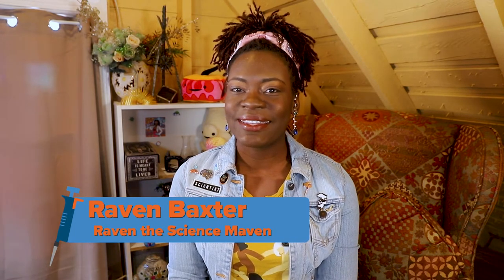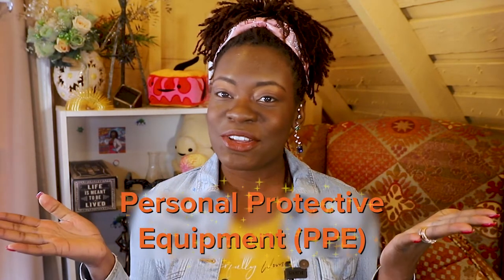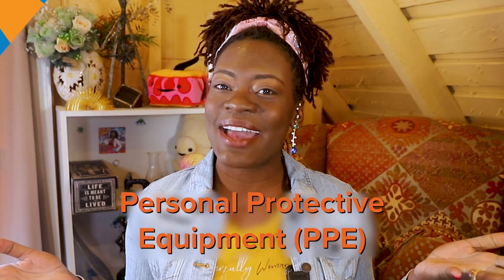Hi everybody! Welcome to AdGene's Intro to the Lab Bench. I'm Raven Baxter and I am bringing this series to you online as a resource for you and all of the molecular biologists looking to start their career in the lab. Without further ado, let's get into our first lesson of Personal Protective Equipment, also known as PPE.